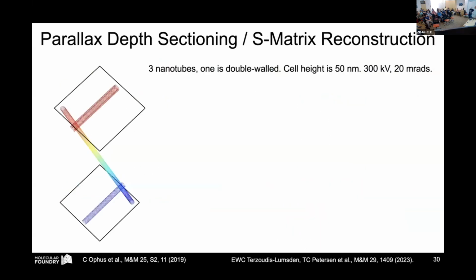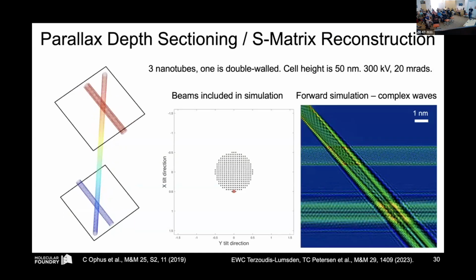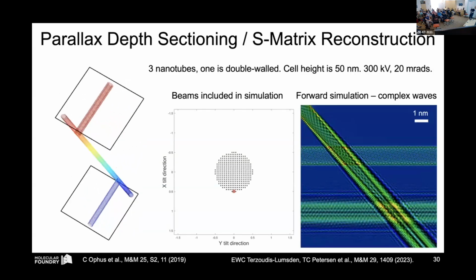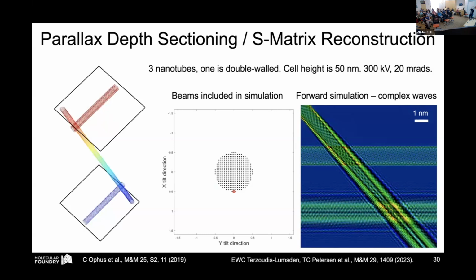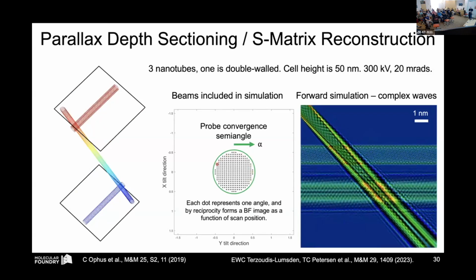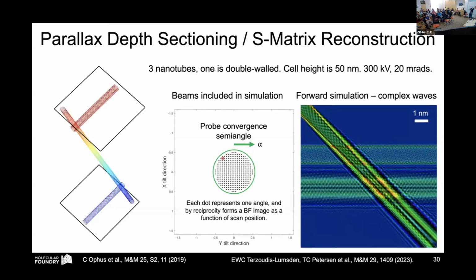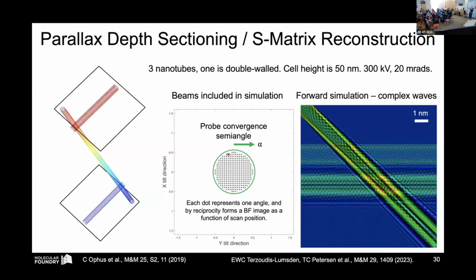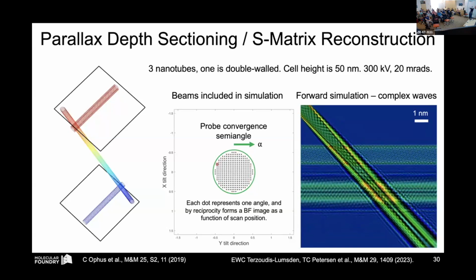function. So if I were to look at another synthetic example here, a 3D plane wave, and I were to take a single pixel in my reciprocal space 4D-STEM data set and make a virtual image from it, and then move it around pixel to pixel, you can see that each one of these pixels in our cone of illumination angles is intersecting the sample at different angles.